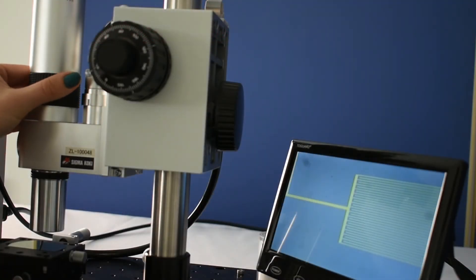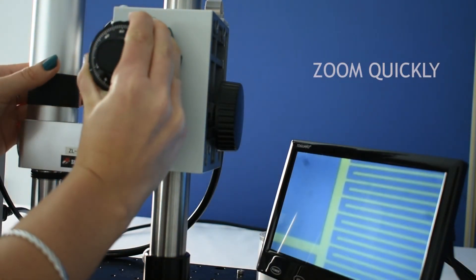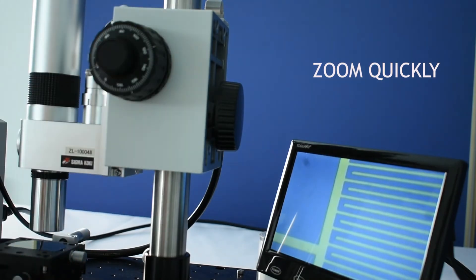Unlike a traditional microscope, the magnification can be easily modified by quickly zooming in and out without changing the objective.